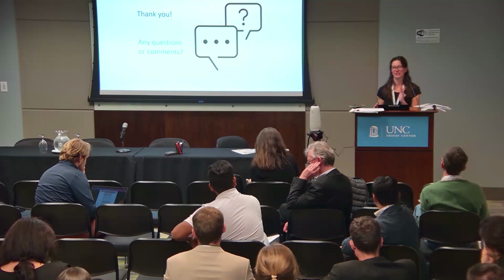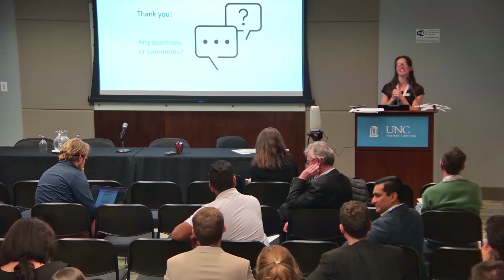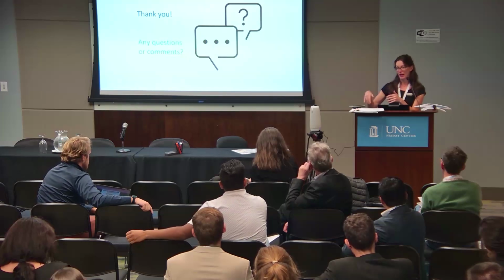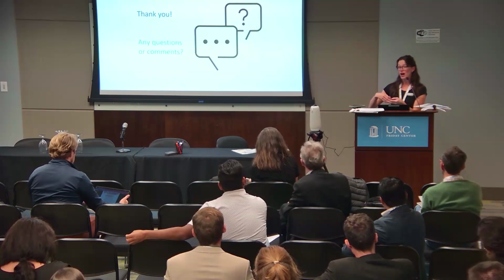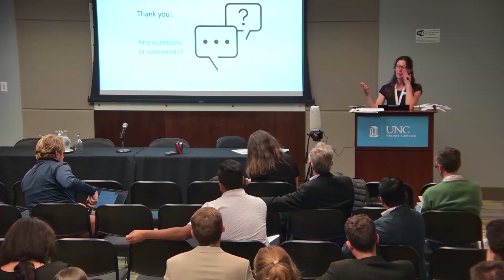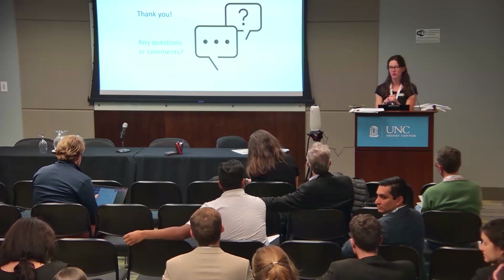Absolutely, and I saw that paper and I was like, yes, this is great. Because it's so true. For example, with our case study with Lalit, they were transporting some samples back to their semi-decentralized lab for that selective ion probe. So definitely there are so many different contexts. When you say field, it conjures a certain image, but in many cases there are semi-decentralized labs or mobile labs, or just so many different approaches.